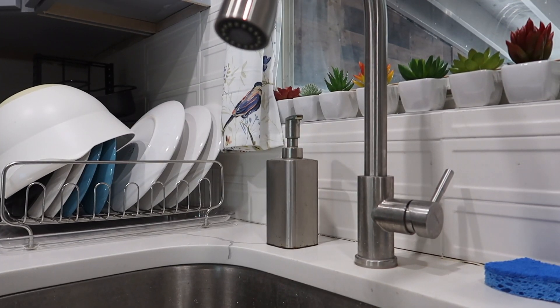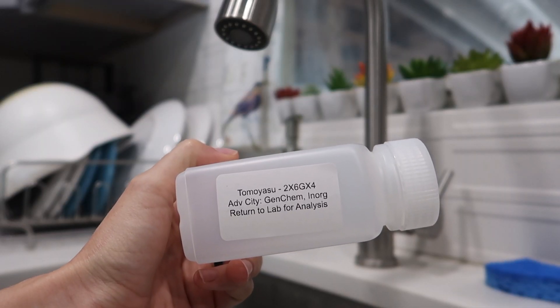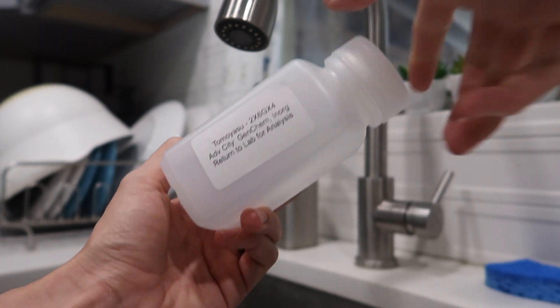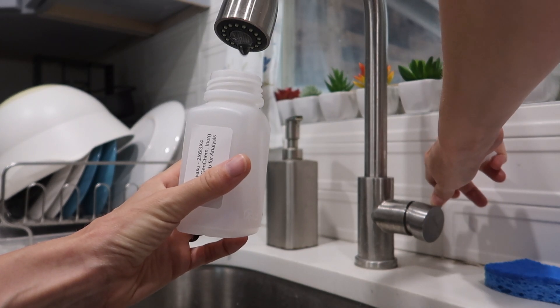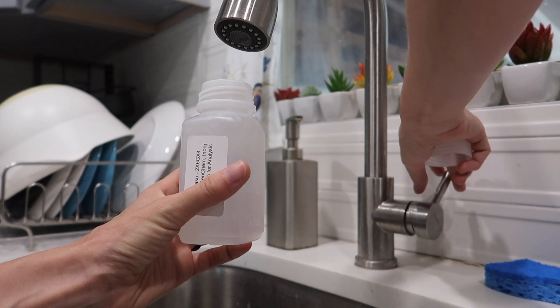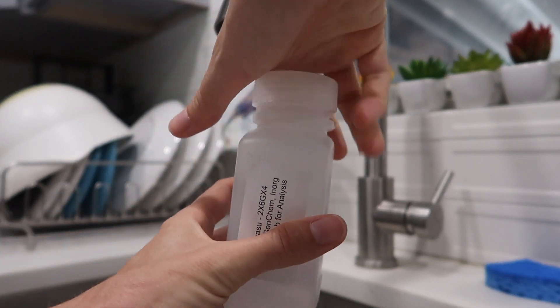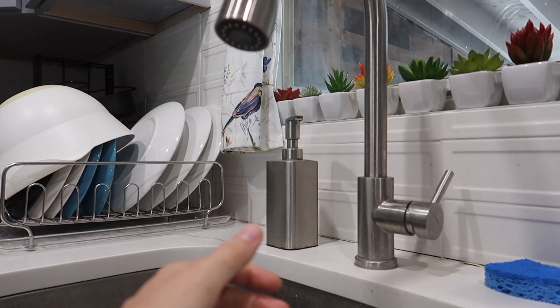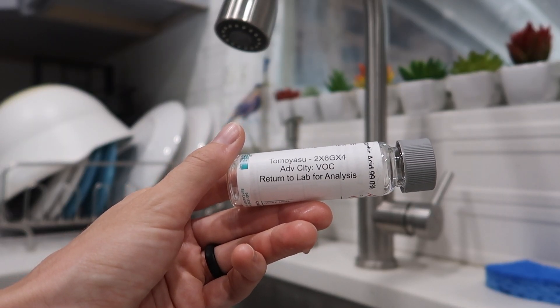We're gonna do our morning water draw. This is the Advanced City Gen Chem Inorganic. And the second one, Advanced City VOCs.